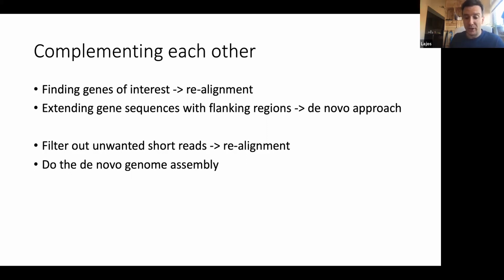If you just want to check whether those specific genes are in your sequencing raw data or not, so this is working with FASTQ data, then you can use Ariba. The first step of what Ariba does is a simple realignment. I think it is using Bowtie 2 or Bowtie, the program that we will use today, and it tries to find those reads that are aligning to your genes.